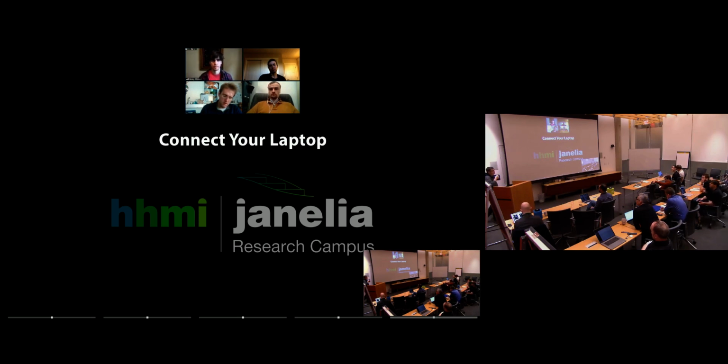On top of that, keeping track of metadata about the specimens and integrating that metadata into our larger database actually takes more time and effort than building the microscope itself. And so that means that if it drives on Micromanager, which we very much prefer, or Python, or if you really, really twist our arm, Labview, then it still needs another layer on top of it to be able to, at the very least, scan a barcode on a slide so that you can enter what specimen that is, because simply writing it down in a lab notebook absolutely does not scale.